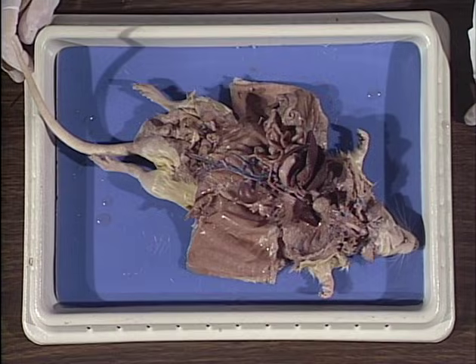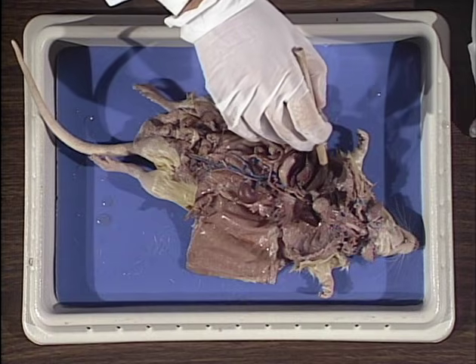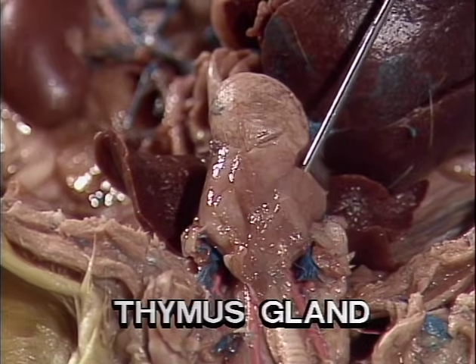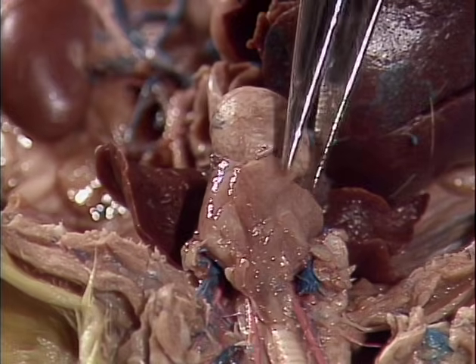The thoracic cavity has been opened to expose the heart and the lungs. The heart is covered with a gland-like structure known as the thymus gland. It is involved in the immune system of the rat. We need to remove this in order to more clearly see the heart.